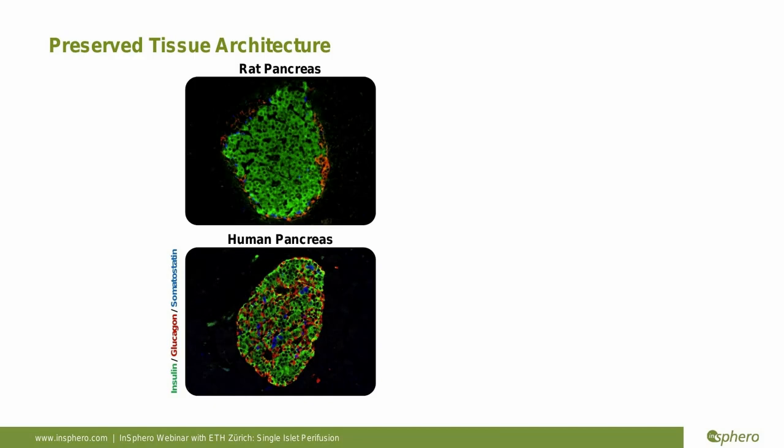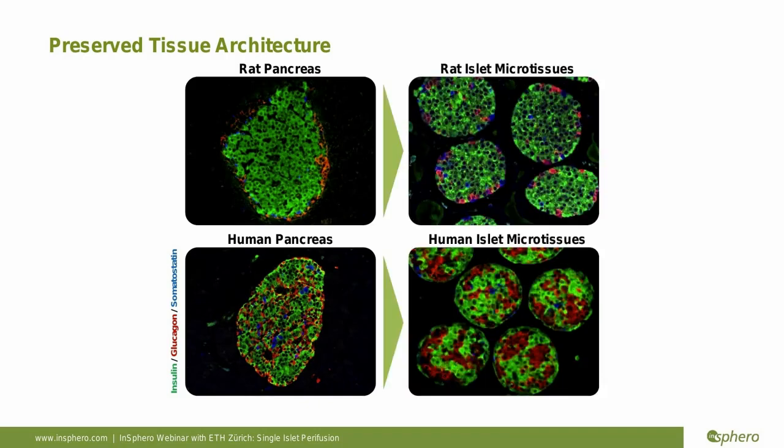It is generally a trilaminar structure, with beta cells in between and non-beta cells generally pushed to the outside, folded on top of itself. When we make our microtissues, we see a similar structure. For the rat islet microtissues, we have a beta cell core and a non-beta cell mantle, just like the rat pancreatic islets. In the human islet microtissues, we see a more intermingled distribution, with alpha cells and beta cells generally arranging themselves in distinct groups.